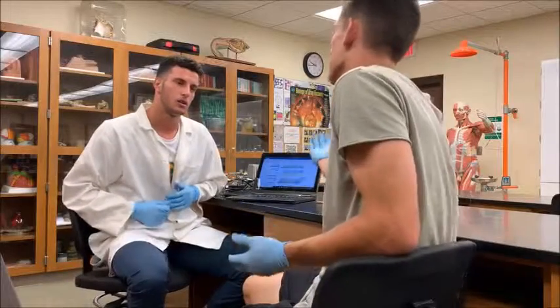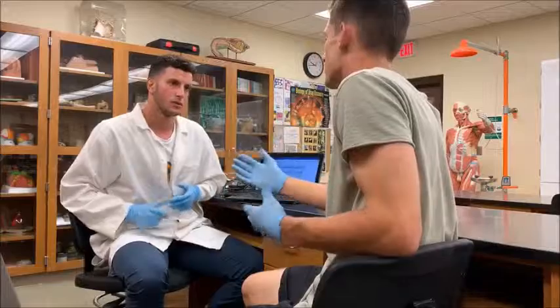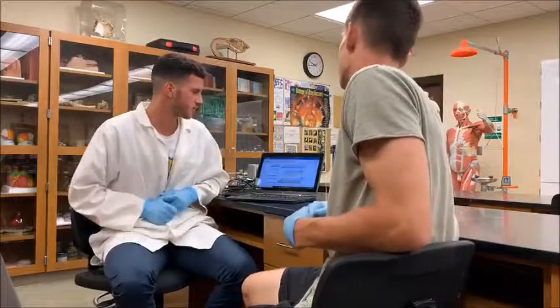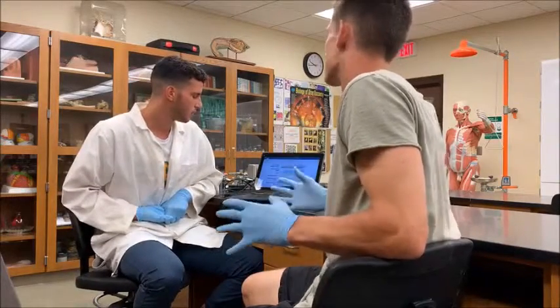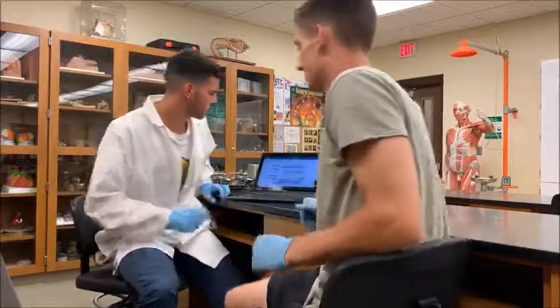And so the proteins are still going to move from negative to positive, similar to how they moved in gel electrophoresis, because they're still coated in that SDS? Exactly, yes. The SDS is still present and the negative charge is still present. Okay, interesting. Do you have some of that material, the turbo transfer, so we can go see it? Yes, I can show you. Okay.